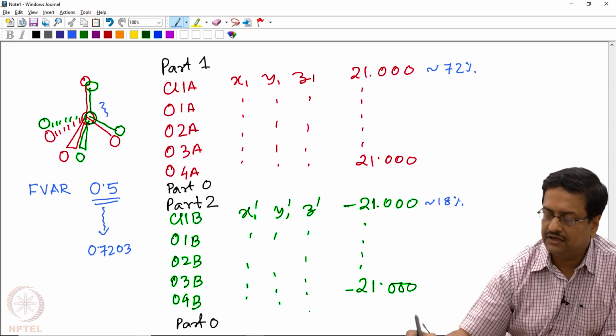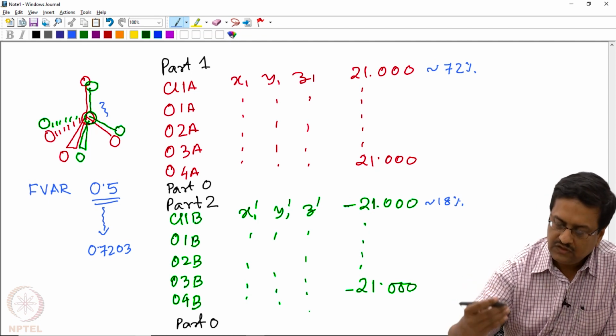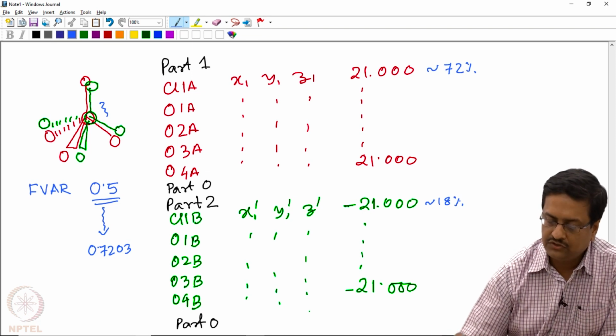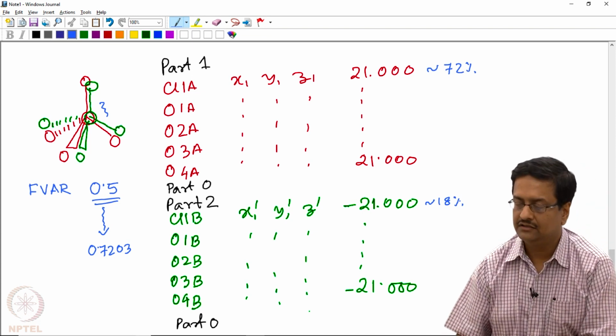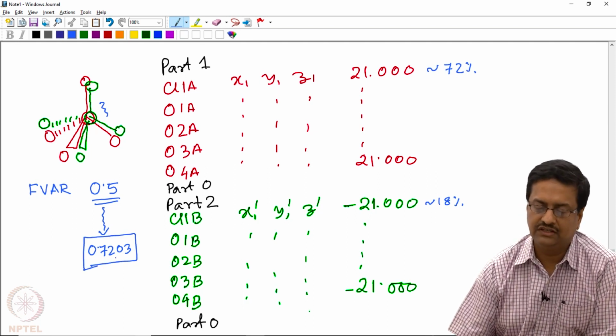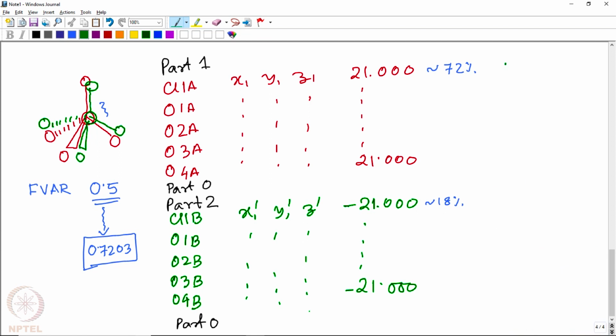So this then refines the relative occupancies of two different orientations, or rather two different locations of those two groups, and then those two anions of perchlorate, and it refines down to a particular occupancy. And then at the end, as usual, you will have the isotropic thermal parameter for all of them, which also will be an independent parameter and will be refined along with the refinement of occupancy.